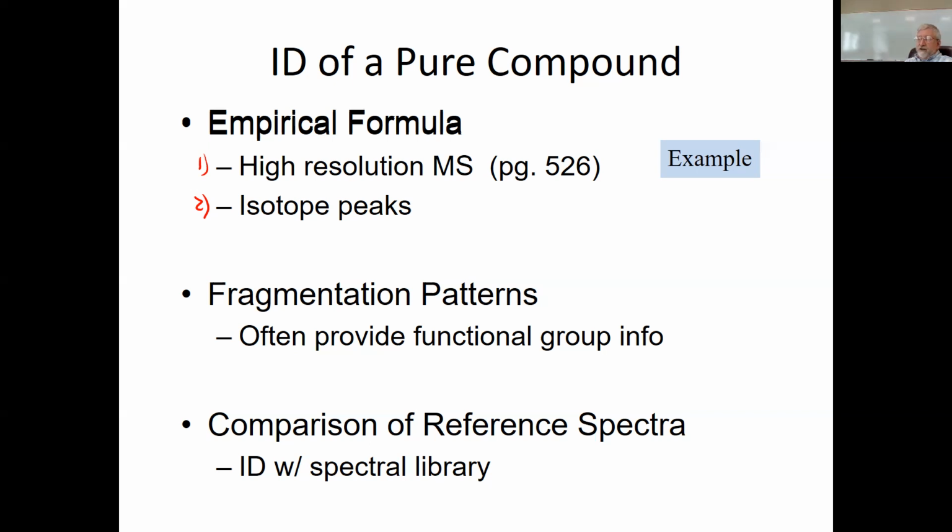No, that's not right. I would need a calculator. I can't do this stuff in my head. I have to add a 14 to it. That'd be a 53 or something like that. But you can see certain losses, and you can look at those pieces that were lost, and kind of get a picture of what's left behind.